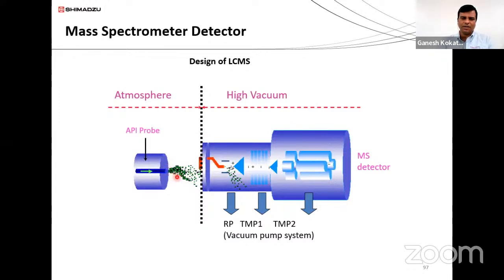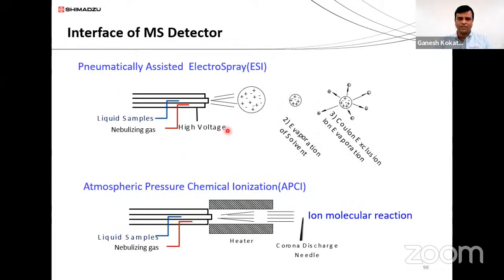That component gets nebulized, and as it forms droplets, those droplets get evaporated. We are applying temperature over here, and that moiety, either in the form of a positive or negative ion, passes towards the detector and detects the mass of a particular component depending on the RT of that molecule. So you may either quantify or qualify it. So this is the phenomenon.